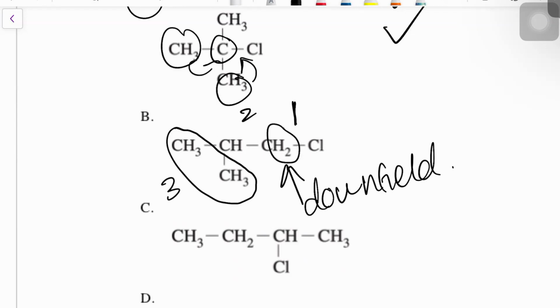This first peak has 1 neighbor, so it's going to be split into 2, a doublet. This one right here, this hydrogen has 8 neighbors. So it's going to be split into 9, which is what, like a nonet? I don't actually remember what the prefix for 9 is. You guys should let me know if you know what it is. But it's going to be split into 9. And then these methyls right here have 1 neighbor only, so they're also going to be split into a doublet as well. Okay.